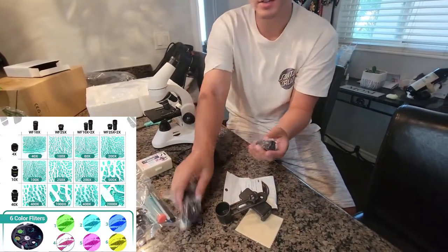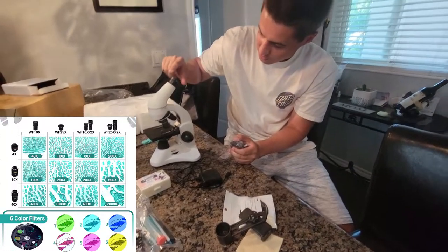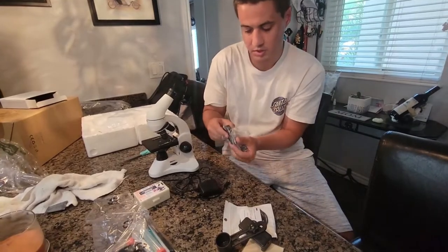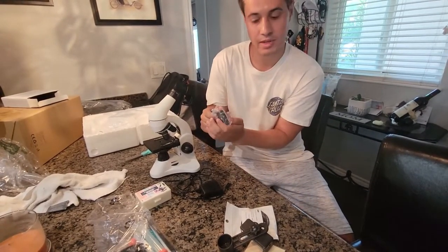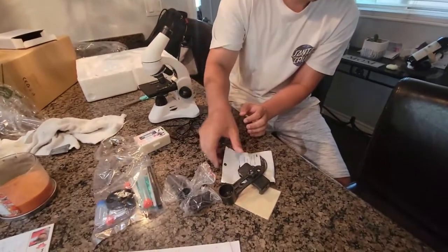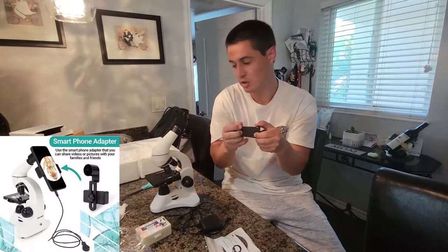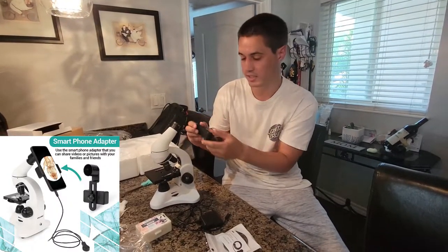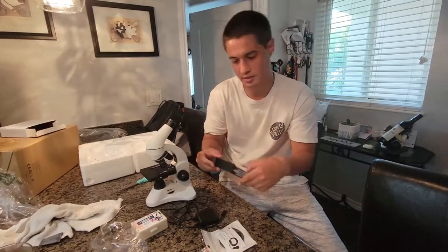It also comes with extra lenses. The lens that's already in there is the max zoom 25X, but it also comes with a 2X if you want to look at things far away, or a 10X, which is about in between. It also comes with an attachment to attach your phone so you can take pictures of whatever you're looking at, making it easier and keeping your phone steady.